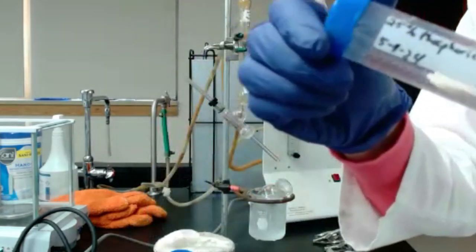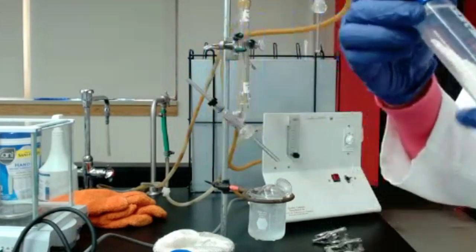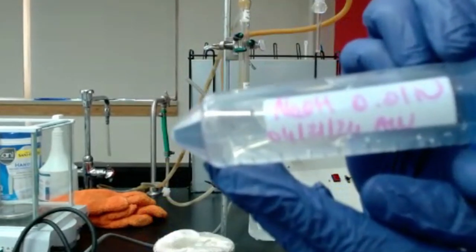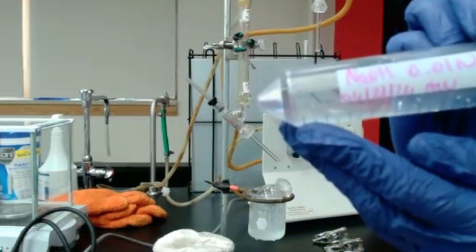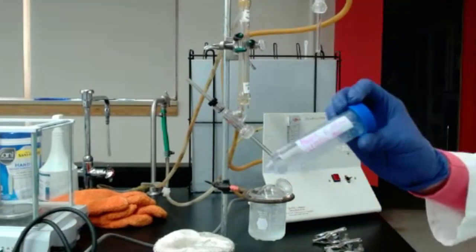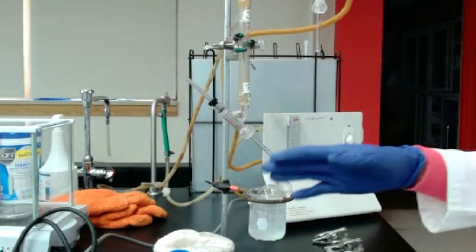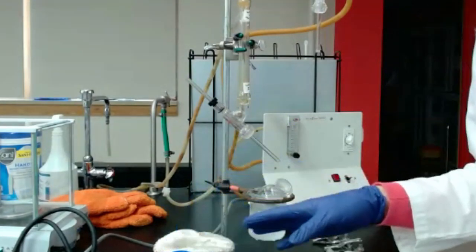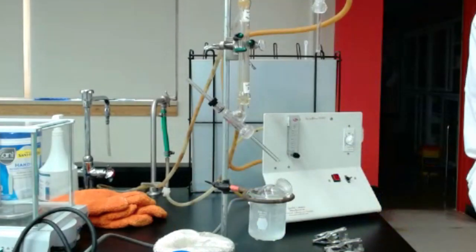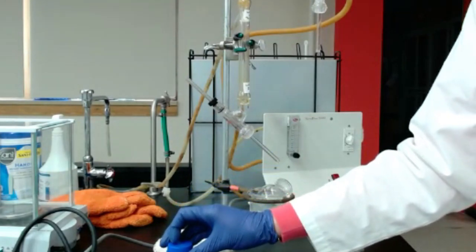That's probably not easy to see, but that's a 25% phosphoric acid solution that you will need. You will need a solution of sodium hydroxide, NaOH, and the strength is going to be 0.01 normal, which is less concentrated than what you use for titratable acidity. So if you don't have this solution standardized, you will need to standardize it. That's really important to be accurate in the concentration of free SO2 and total SO2 you're going to measure. So make sure you have 0.01 normal sodium hydroxide.